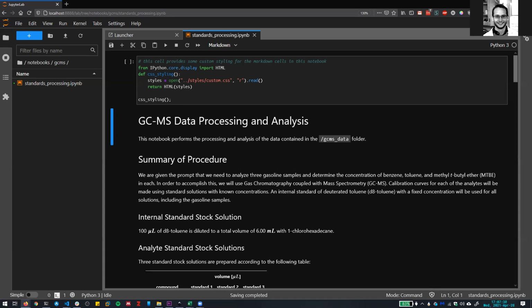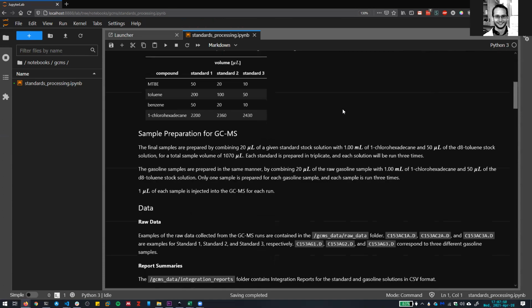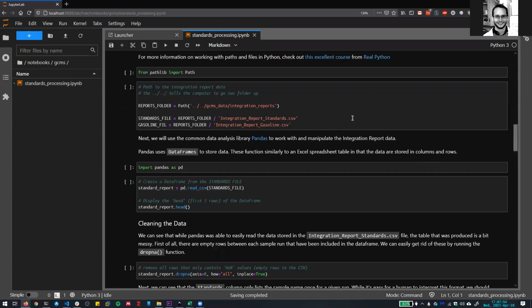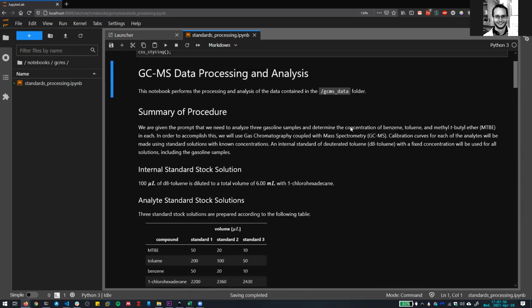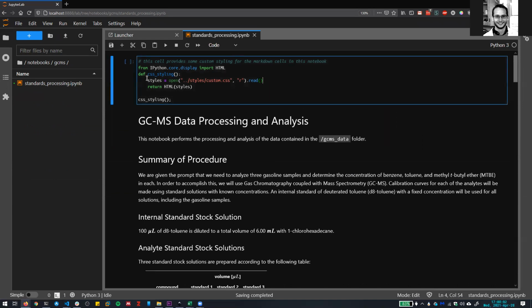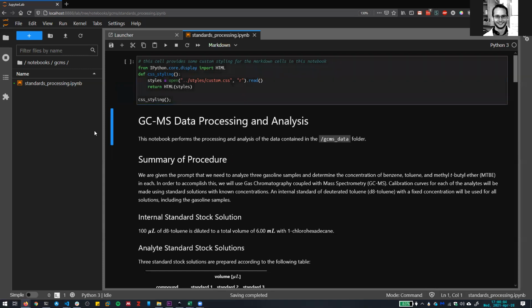Okay, so based on that last thumbs up, it seems like most people are there. So I'll start going through this. If you need help, just interrupt me and let me know, and we can tackle it together. We looked at this on Monday a little bit, and this is what's called a Jupyter Notebook, and it allows you to run Python code in sequence. So this thing up top, for instance, is a code cell. And these other things that I've put in here are markdown cells.